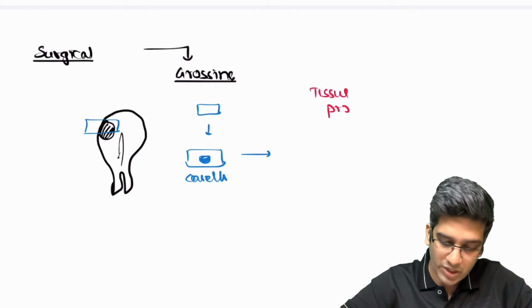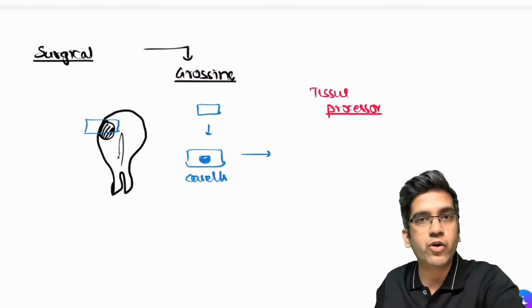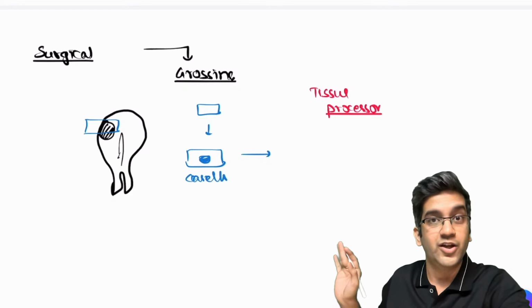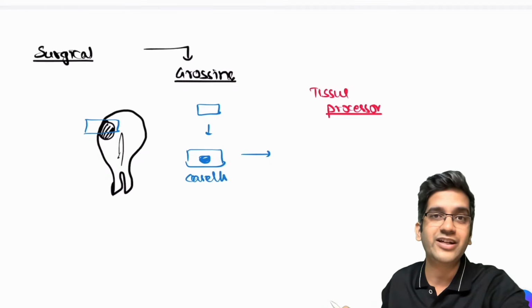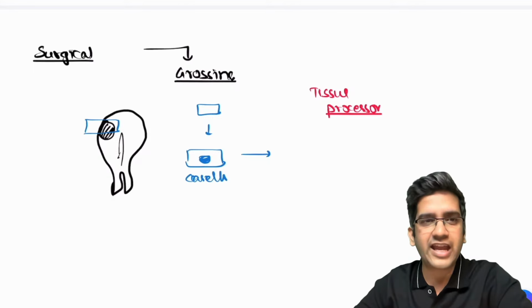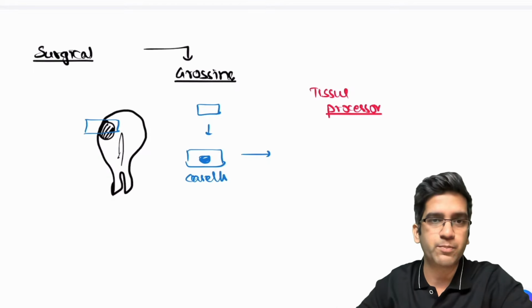In the tissue processor, what happens? Yesterday, if you remember, I told you that for a normal processing of tissue, it takes like 17, 18 hours. That's what this tissue processor does. Though we call it fast, in spite of that, it takes lots and lots of time, right? Because it's a very slow process. And every step you see in the tissue processor is important for us, right?